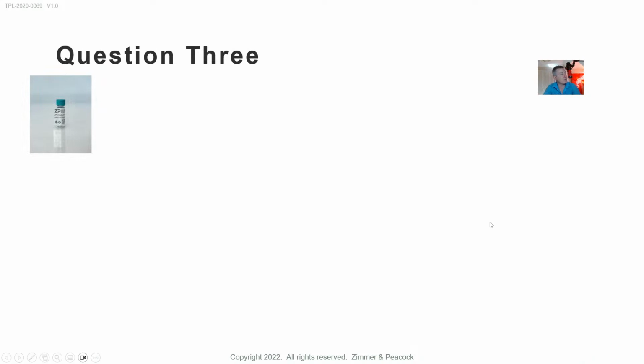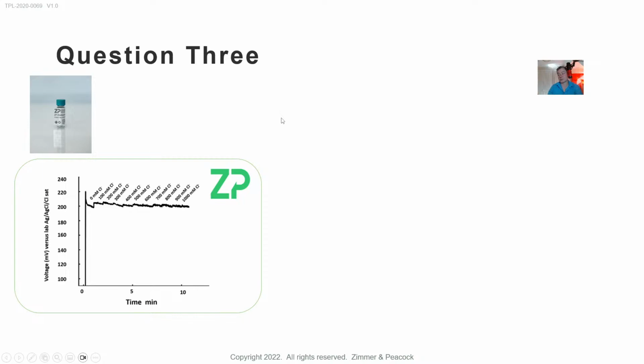Question number 3: if you're making a biosensor for maybe a perfusion system where the chloride is constant, then you don't have to worry about this. If you're making a biosensor for testing in blood, you don't have to worry about this. If you're making a biosensor for testing in interstitial fluid, you don't have to worry about this. But there are some applications, for example, testing urine, where the chloride concentration could be variable, and people making biosensors there want to put a drop of urine and get a signal, and they may have to work on making their reference electrodes. We sort of call it chloride resilient, but it's a way of really making that silver chloride reference electrode not sensitive to the chloride in the sample. And so we actually have a solution for that. We have a solution that people can buy and pipette onto their particular product.